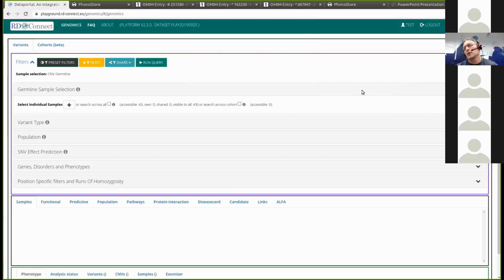Okay. So this is the screen that you'll see first when you log in. And as I said, the first thing we want to do is select the samples that we wish to analyze.